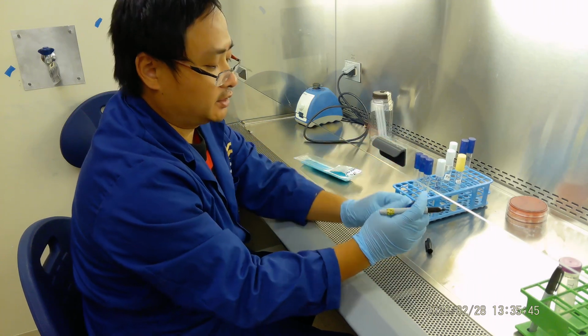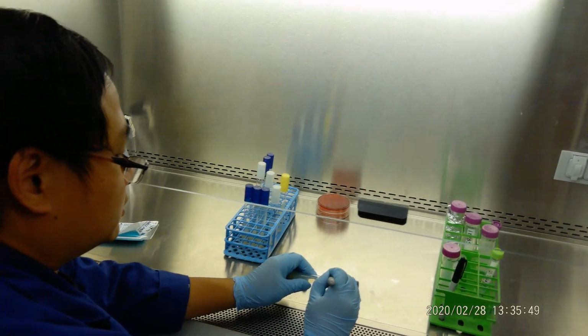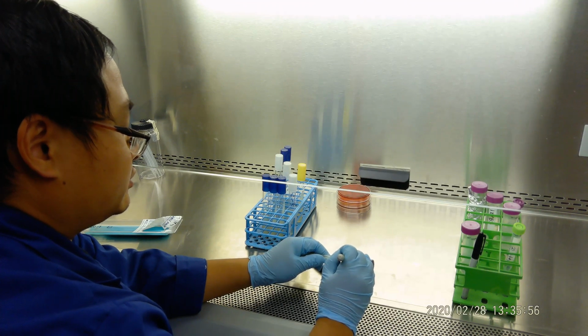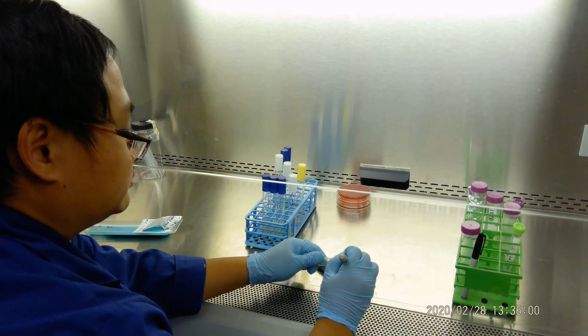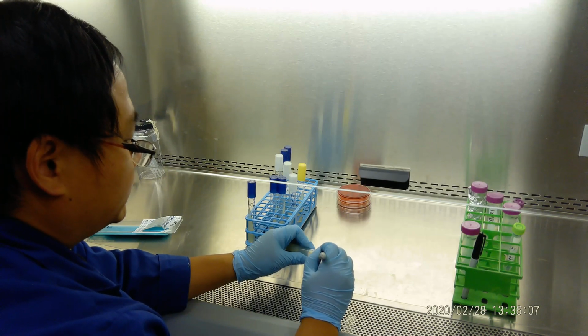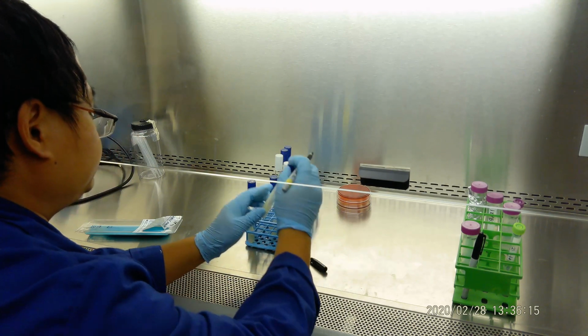Now first of all, you're going to label all these with the temperature. So we do E. coli at 4 degrees Celsius, with the initial, bench number, and the date. Now the E. coli at 25 degrees Celsius, which is room temperature, with initial, date, and bench number.